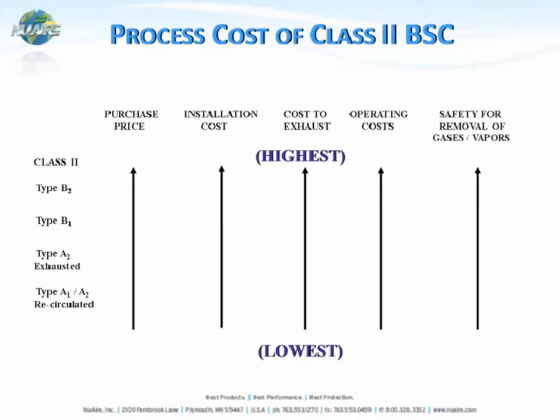By accepting higher costs with B-type cabinets, the safety for removing gases and vapors increases. If you're working with high levels of gases and vapors that need to be safely exhausted to the outside, that may take precedence over initial purchase price or cost to exhaust, and you'll want a Class II Type B1 or B2 cabinet. If you're not working with gases or vapors, you can use a recirculated A2 cabinet with a lower purchase price and installation cost.